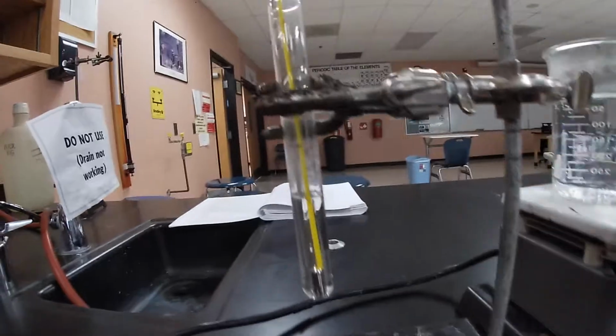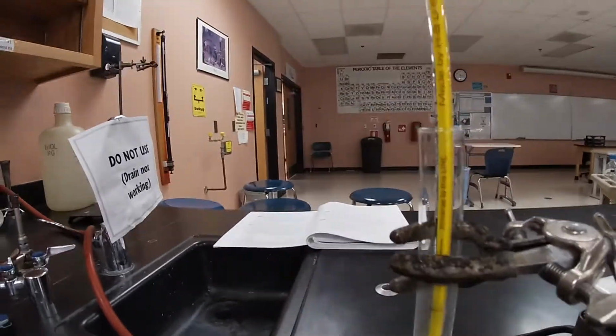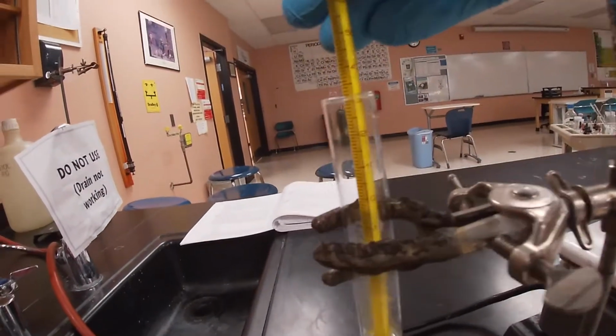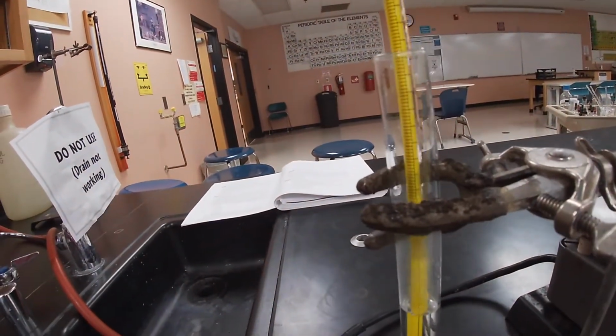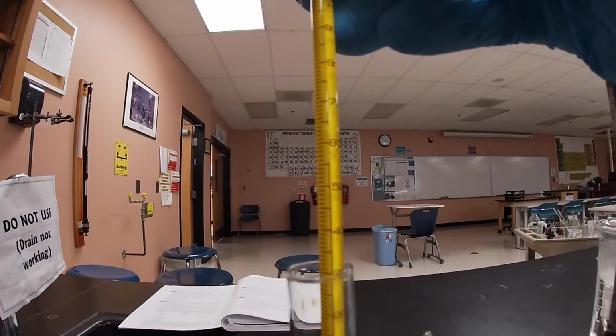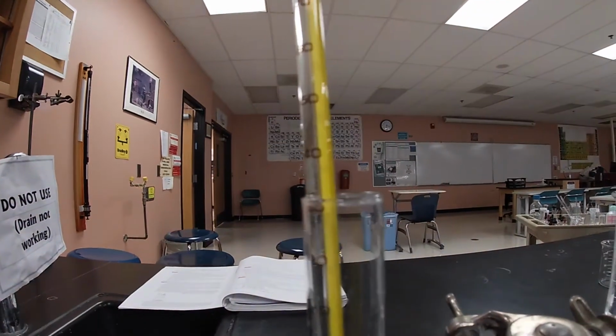And that's it. That's the temperature right there. Let's go ahead and check. I already see the crystals forming. Let's go see if we can give you a temperature. Yeah, I say 57, 56. We're at 55 there to be exact.